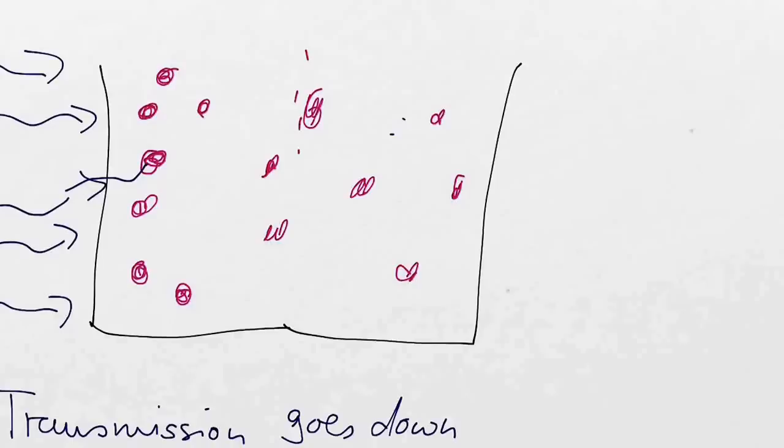So that was the old container here, but now I doubled it. What would happen to the transmission? More or less? It's less, isn't it? So when first 2 went through, now maybe only 1 goes through.